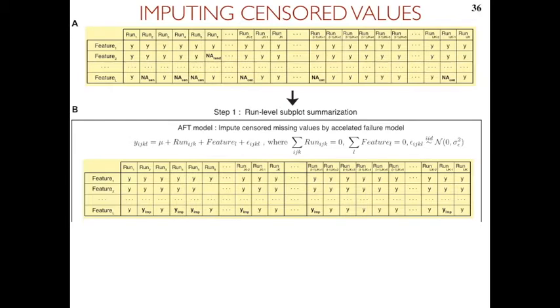The problem is that our data often are not like that, right? We work with discovery experiments or DIA, which do not have really strict characterization for each protein. Then essentially we're saying it's below the value which makes sense to us. And this may or may not represent limit of detection, but we may not just have enough data to even know what these numbers are. So we just say it's below what is visible to us for whatever reason. Yeah, but really good question. Okay, so that's what we do.